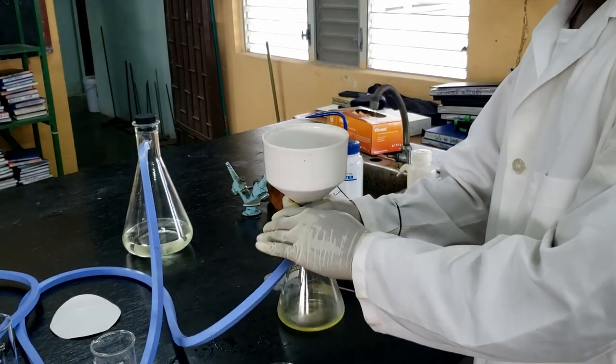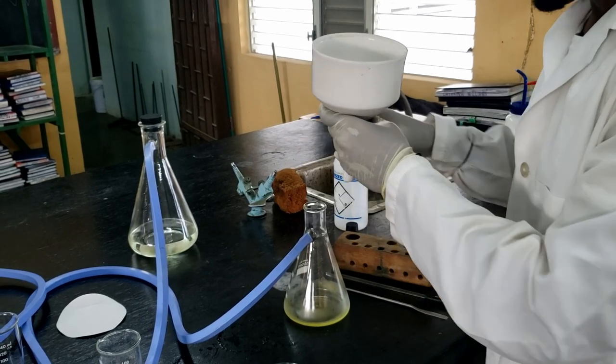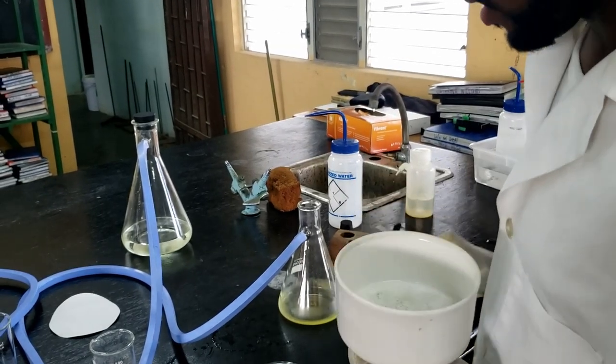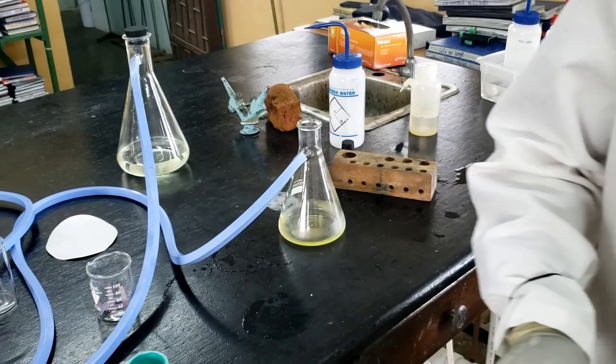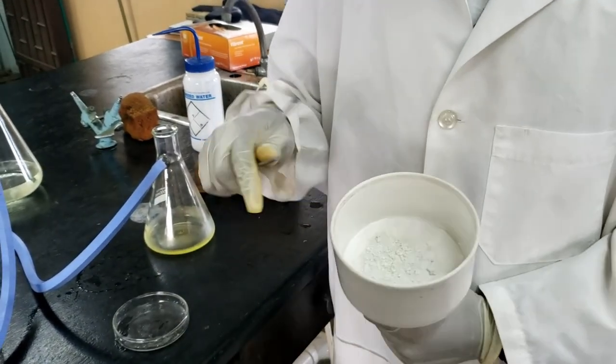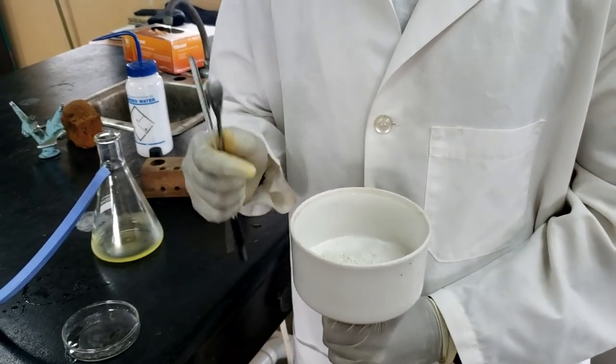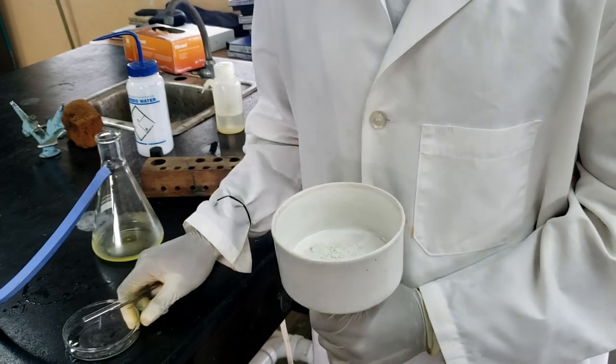So we've allowed the crystals to dry and drain into that mother liquor. So again, we move to go and weigh. And this time I'm going to show you what we do to get the melting point. So after I'm finished weighing, I'll show you the melting point apparatus and how we determine that.